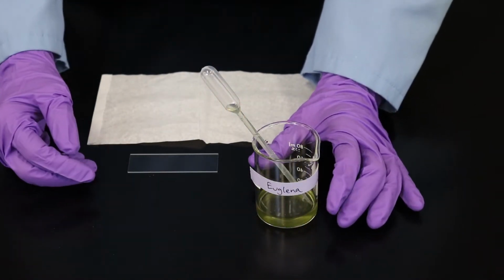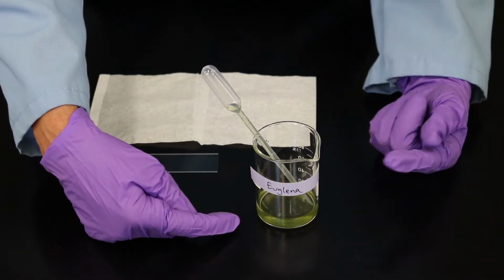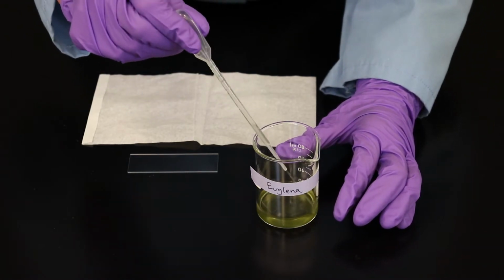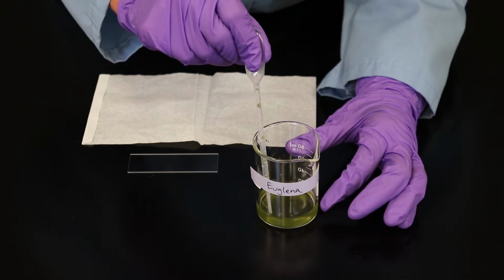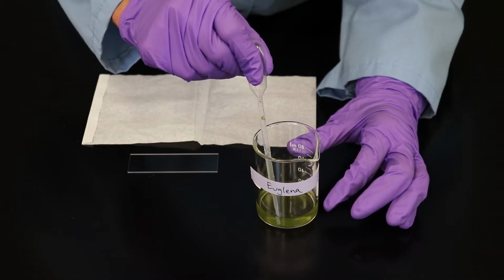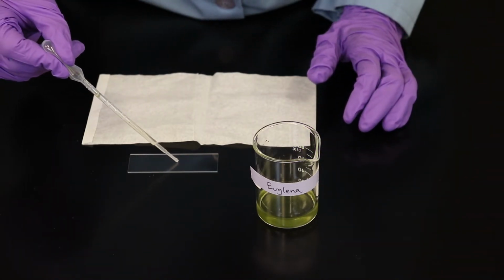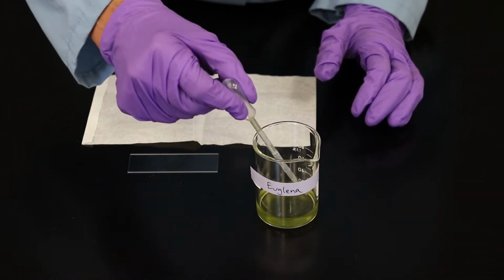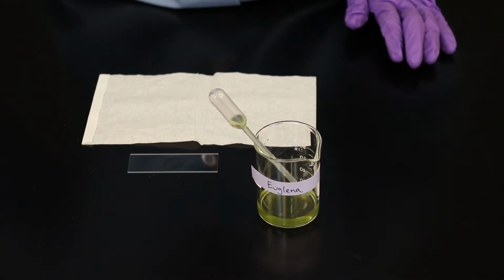To make the slide of the Euglena, I have a subsample of the larger jar, and I'm going to use a small pipette and look for a little bit of the material that's kind of green and gooky at the bottom, put them in the pipette, and then carefully, it's easy to overdo this, put a drop or two on my slide. Doesn't look like much, but there it is.